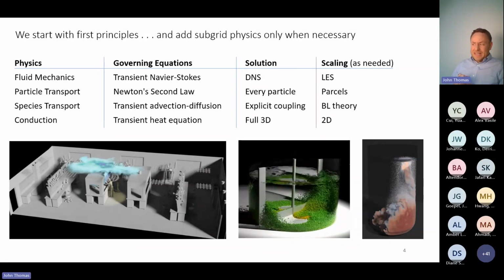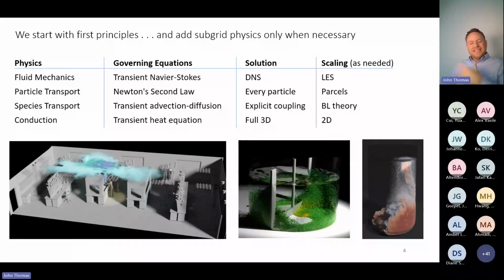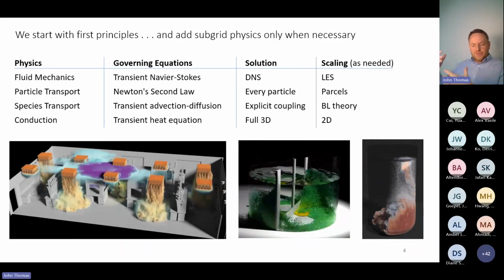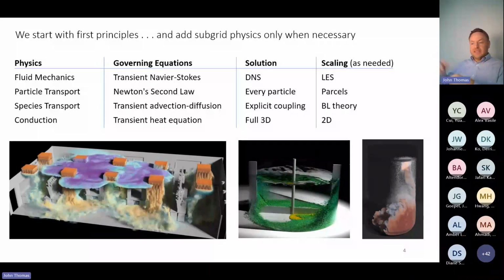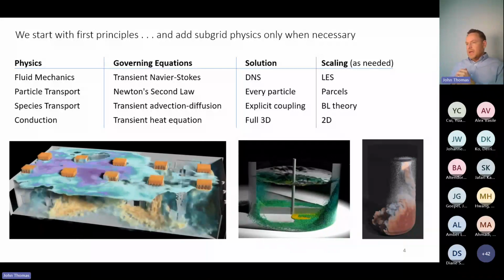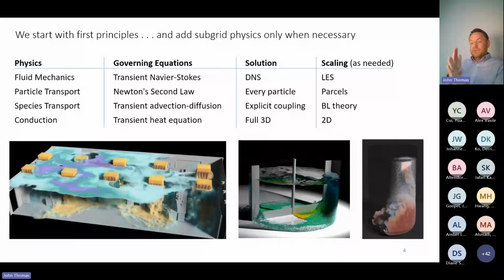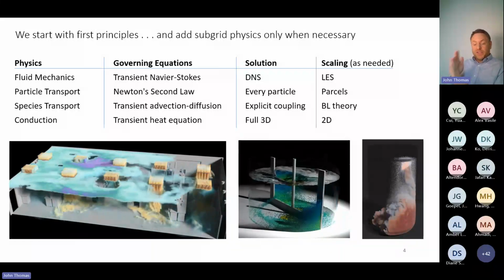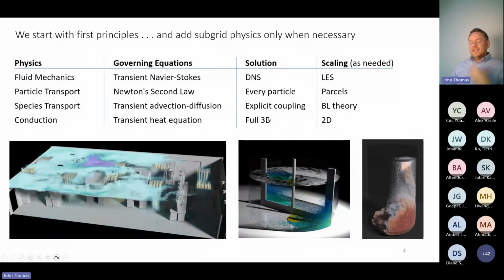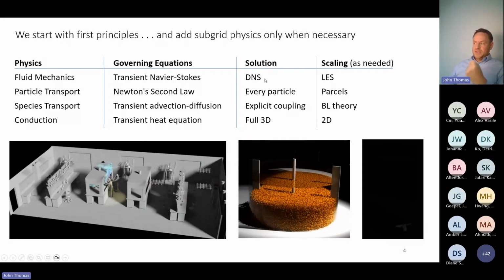We're going to do it in line and in tandem. We're going to be solving the advection diffusion equation in tandem with the underlying Navier-Stokes equations to predict the combined effects of fluid flow and chemical reactions. We'll talk about that today, and maybe how those reactions, say, inform viscosity and whatnot. Likewise, for conduction, we try for full 3D. If we need to do some 2D surface-based representations, we may, but generally, we're seeking to describe these models at the level of the most foundational transport physics we can describe.